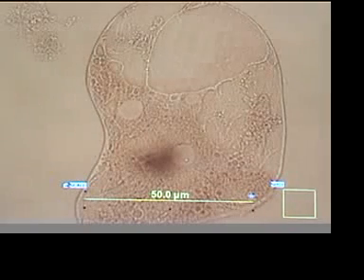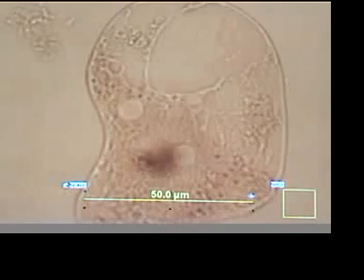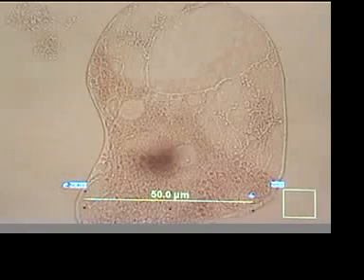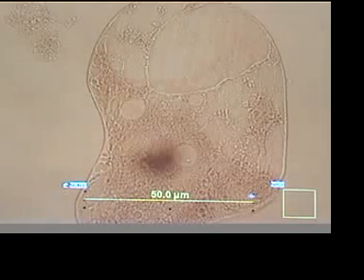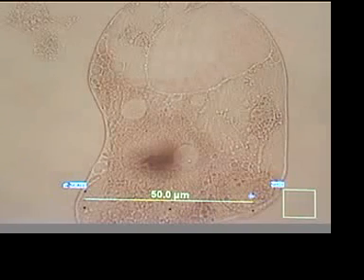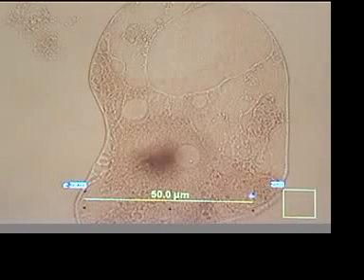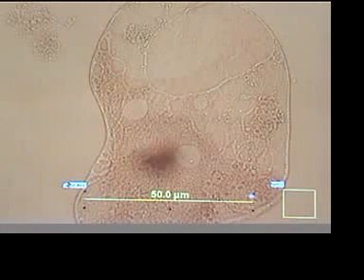He's really grown very large. I'm adjusting the focus. This is real time. This experiment has been running now for about 19 minutes. And the tremendous change in overall shape, tremendous disintegration here of the internal structures, the addition of numerous spheroid structures, small, medium, and large, that were not there. This is happening in real time.